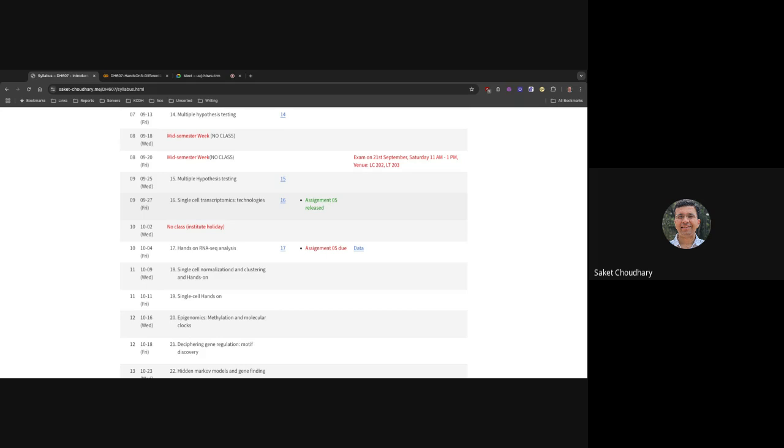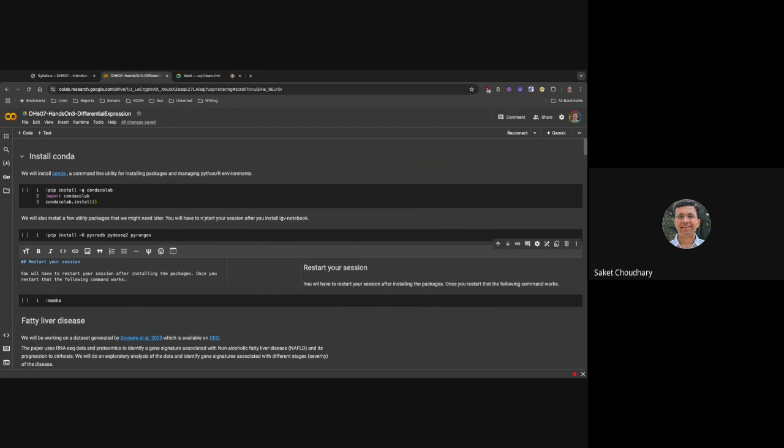Okay, so the goal for today is to do a hands-on exercise, and I've uploaded a notebook on lecture 17. If you click on this, it will take you to a Google Colab, which would look like something like this. The overall goal is that we do an end-to-end analysis of a publicly deposited bulk RNA sequencing dataset. Ideally the starting point would be that you look at the raw data, you start aligning it, and then you get into the final counts matrices, and then you perform a differential expression analysis.